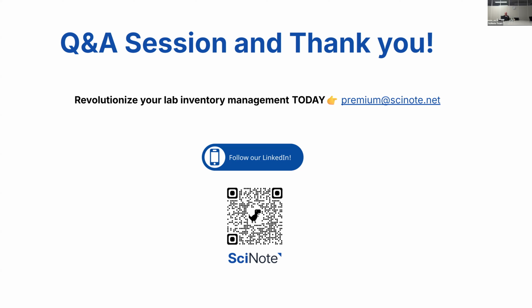I don't completely understand, Adele, your question about how to link the data. What exactly did you mean by this? So I'm going to skip that one. But somebody will reach out at the end to make sure that we get the right information to you.